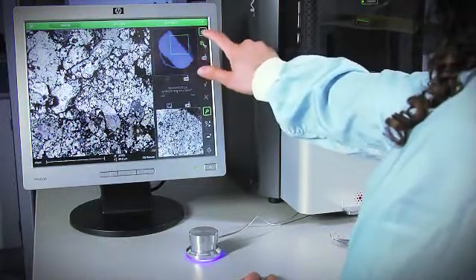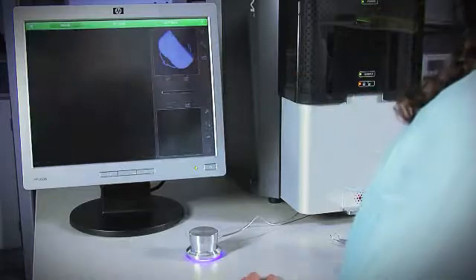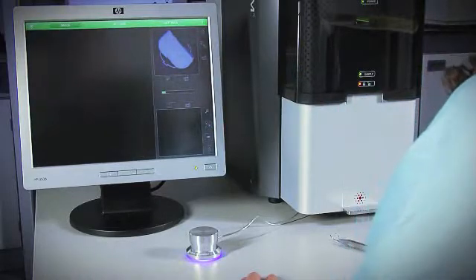Once satisfied with the image data, press the Eject button and the Phenom is ready for the next sample.